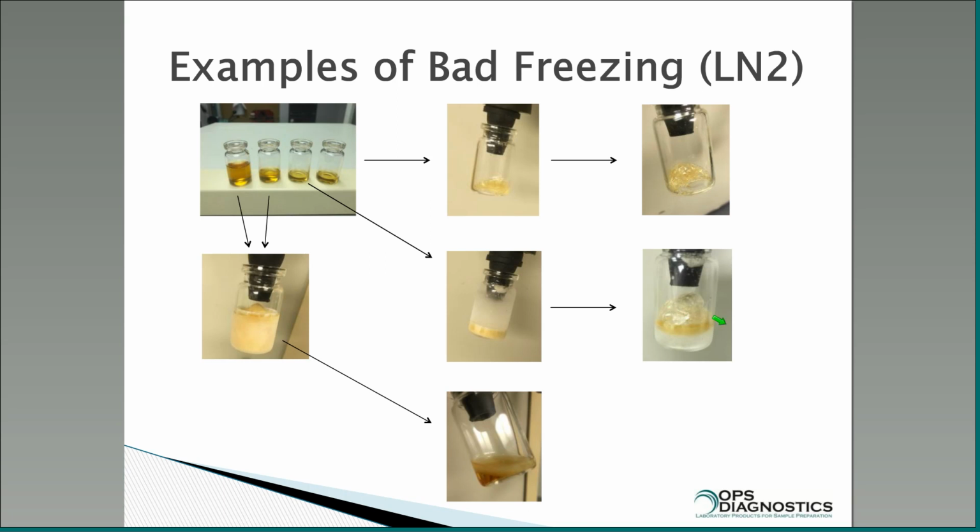So this is kind of like halfway between good and bad. There is a cake in here, right? But it did melt in the process of being freeze dried. So not the best result, but definitely better than the other two.